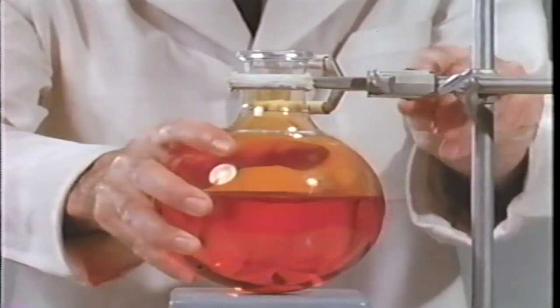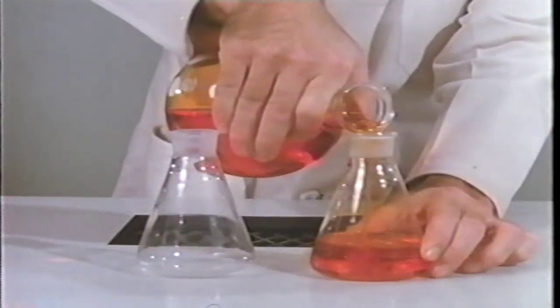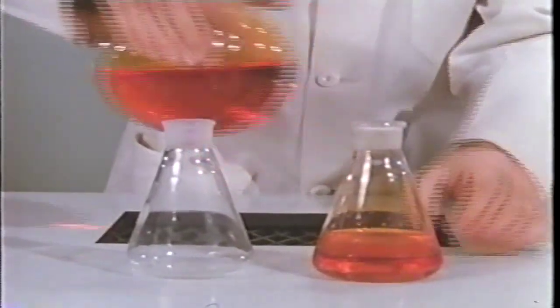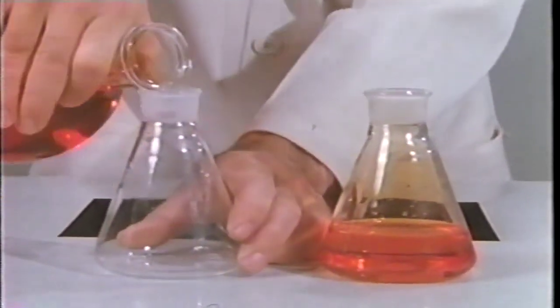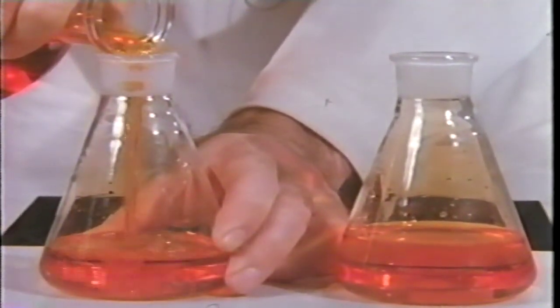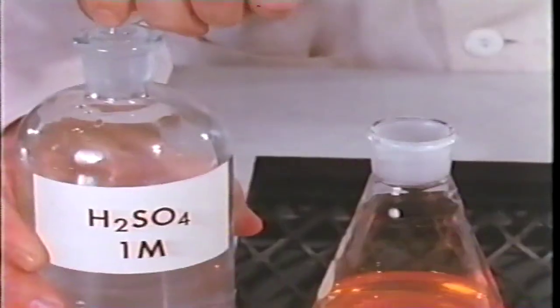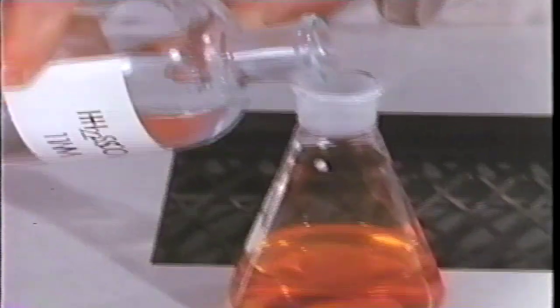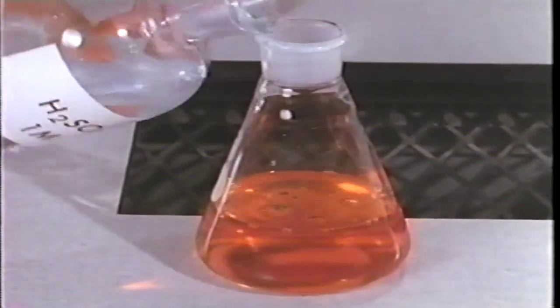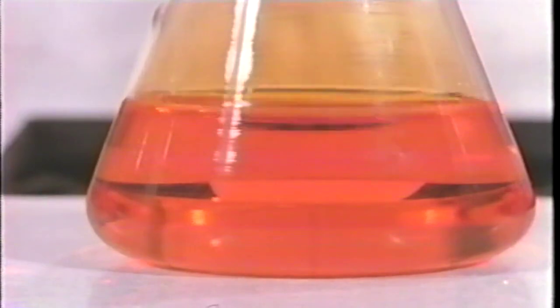What are some of the chemical properties of this aqueous solution? Let's divide the saturated solution in order to check the effect of varying the acidity. To this flask, we add acid. The color does not change appreciably.